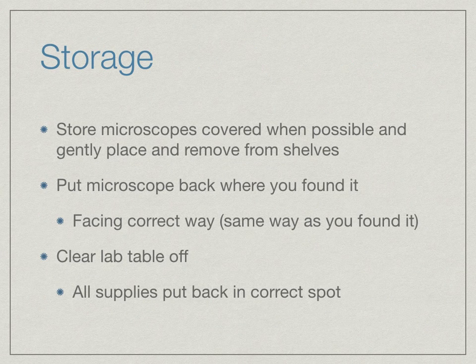When storing the microscope, make sure you store them covered when possible and gently place them and remove them from the shelves. Put the microscope back where you found it, facing the correct way — the same way you should have found it. Make sure your entire lab table is cleared off and all supplies are put back in the correct spot.